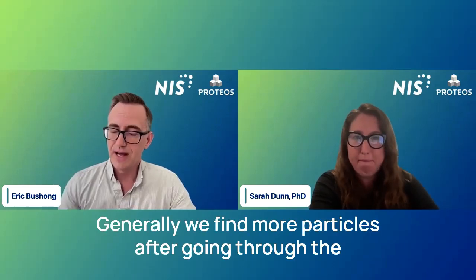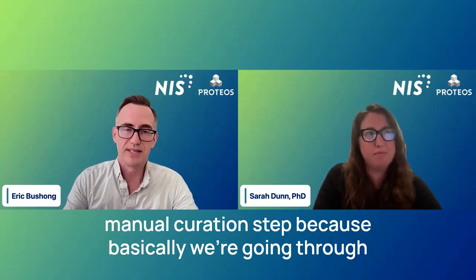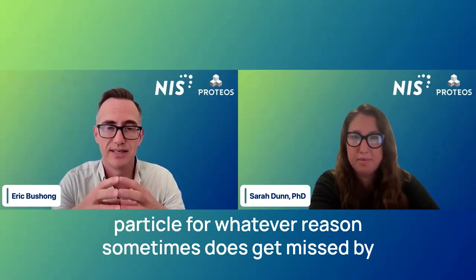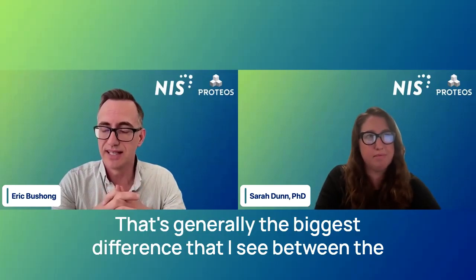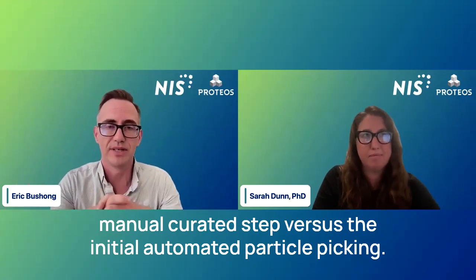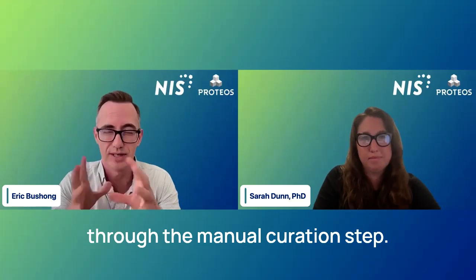Generally, we find more particles after going through the manual curation step, because basically we're picking up some of the false negatives, where a perfectly good particle, for whatever reason, sometimes does get missed by the automated particle picker. We pick up some of those and we add them. That's generally the biggest difference I see between the manually curated step and the initial automated particle picking: we actually end up with a few more particles after manual curation.